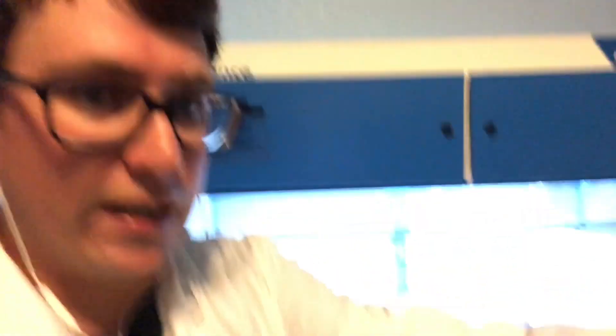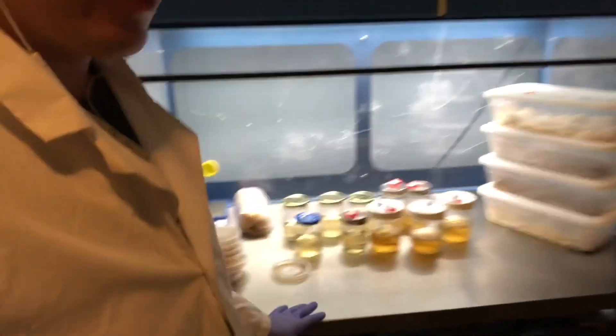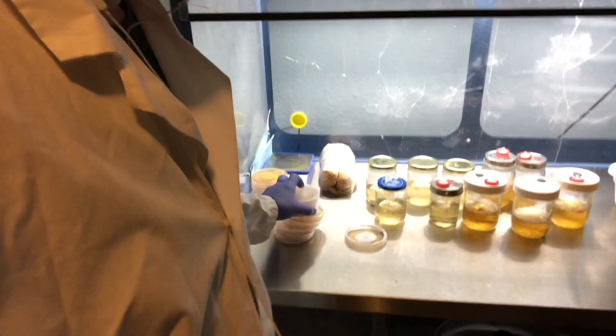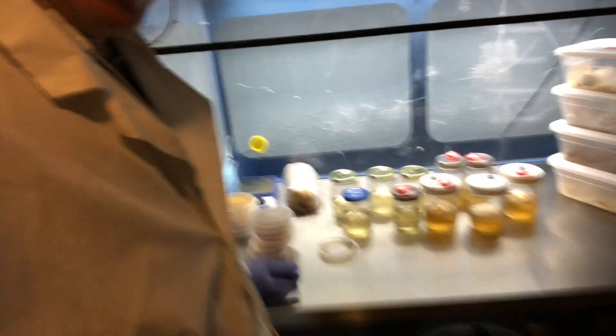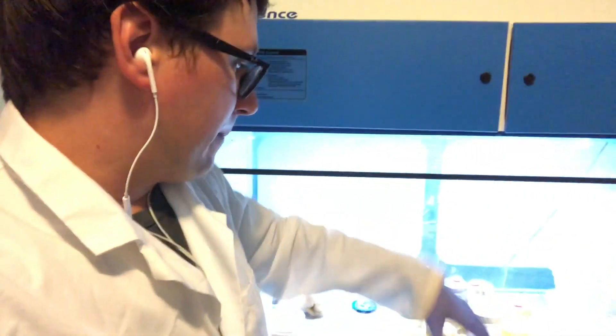So that's the update — this is week seven from spore and it's going really well. I'll give you guys the update as I inoculate these phenotypes in the jars. I'm going to be going through the remaining eight different phenotypes this week to make liquid cultures, and I'll do trial runs on those. Maybe we'll get some really cool looking cordyceps.